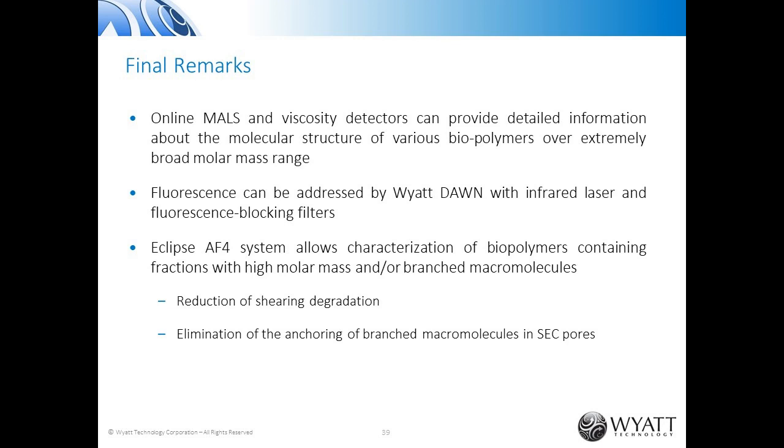What is the advantage of using a viscometer for the characterization of branching? Yeah, this is a similar question to the first one. As I already said, it is more sensitive because we get the Mark-Houwink plot, the relation between intrinsic viscosity and molar mass. We learn from the slope of that plot that for highly compact, highly branched macromolecules, it can drop down to 0, and it goes over 1 for extended structures. And the second advantage is that it also can be used in the region of oligomers. The applicability starts at just several hundred grams per mole.